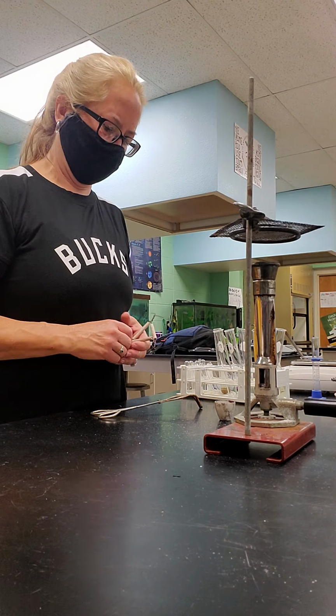So, what's happening? Will, what's happening? It's really bubbly and fizzy. So it's giving off a gas. Feel the test tube, Will. Got really cold. The test tube got cold. So when you have a chemical reaction, there's always an energy exchange. Sometimes energy is given off. Sometimes it's absorbed. In this case, it's absorbed because it got cold. You can feel it got cold.